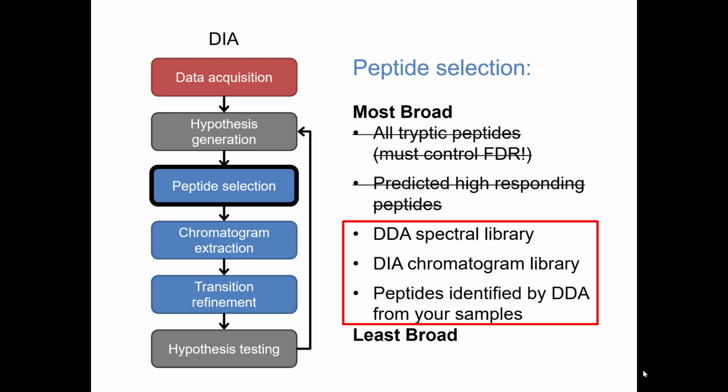So then you need to look at some of these alternative peptide strategies, or buy the peptide and synthesize it yourself, and see what it looks like on your instrumentation that way. Or construct your own library, or some other strategy along those lines.